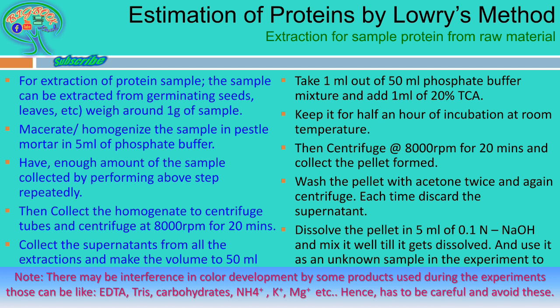Here, this particular slide is also a part of the procedure, but I have made it a little separate with a different topic, because in the further slides we will discuss a regular lab experiment. If this is separate, the learners or the students can understand very well. So here, this slide explains how to extract the proteins from the raw material.